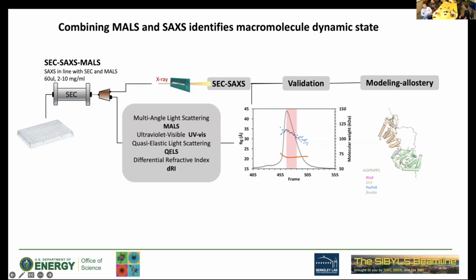What it means is that if we calculate the structure for this, it looks like this, and based on the SAXS, we find out that there is lots of movement between two domains, the brown one and the green one, but it's also a very transient or synergistic interaction between two parts of the molecule.